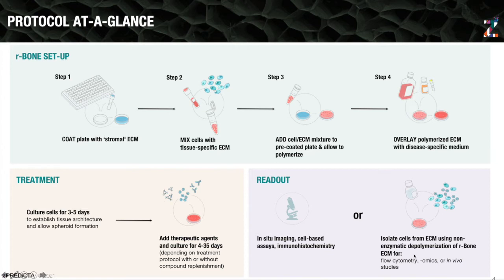And then the treatment, we start 3 to 5 days after culture setup to allow the cells to really rest and start forming spheroids in the cases when they form spheroids, but really to allow the tissue architecture to form. And then the treatment time, as I said, really varies.